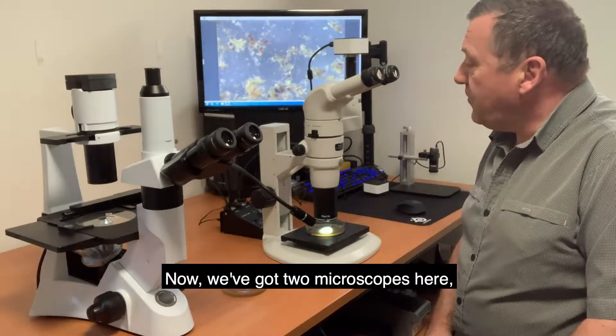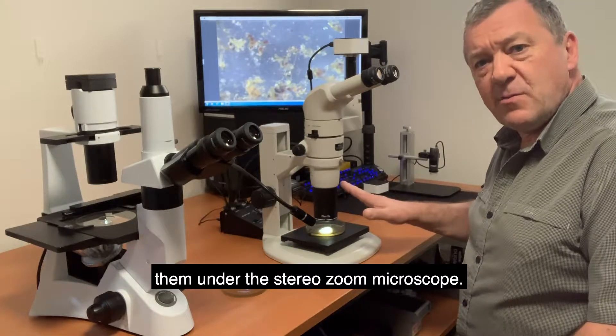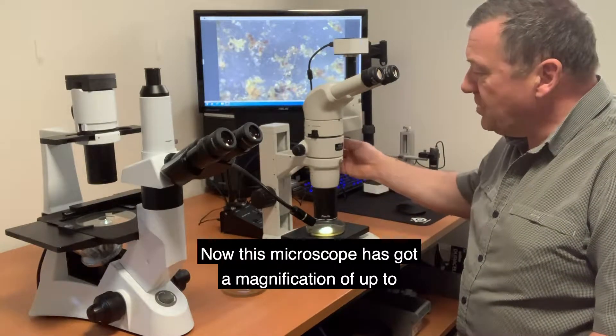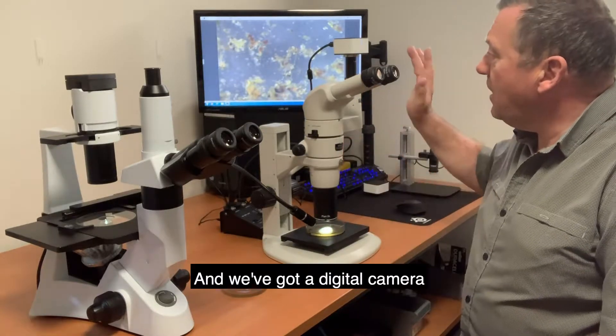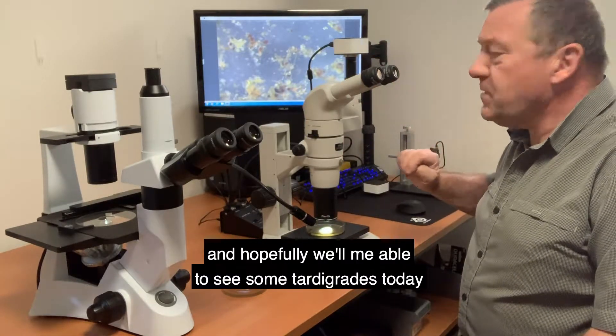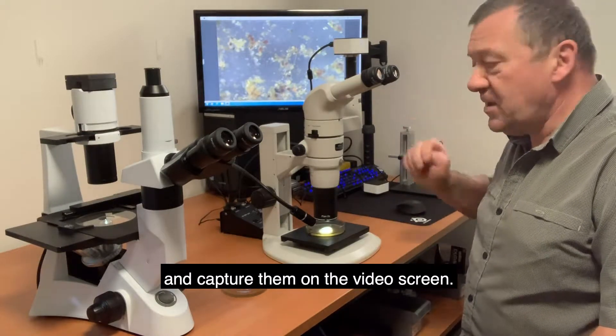Now we've got two microscopes here. We're going to look at them under the stereo zoom microscope. This microscope has got a magnification of up to 160 times and we've got a digital camera, and hopefully we'll be able to see some tardigrades today and capture them on the video screen.